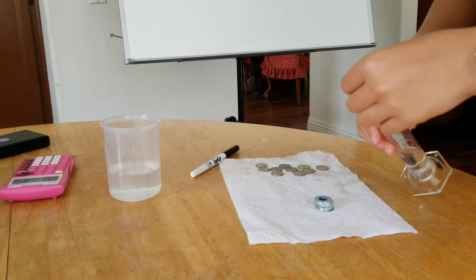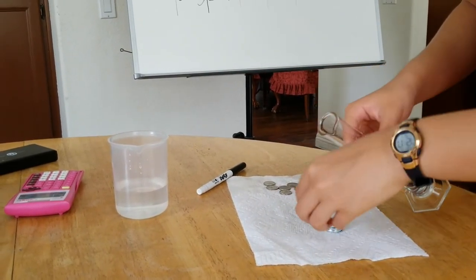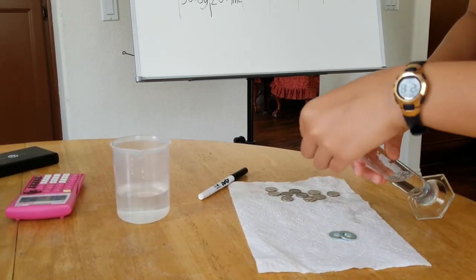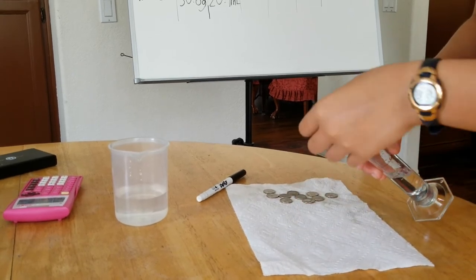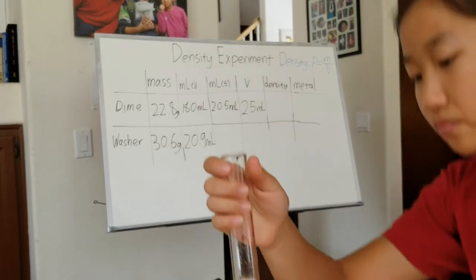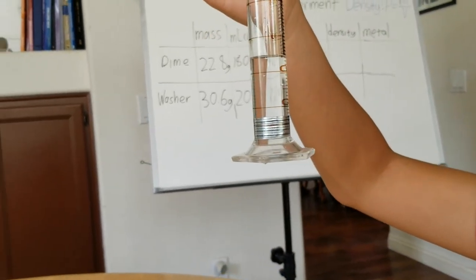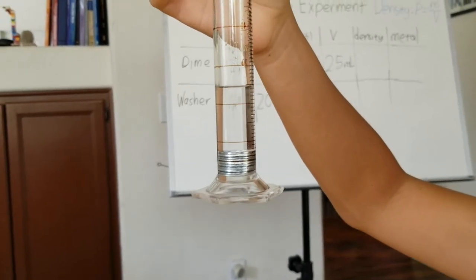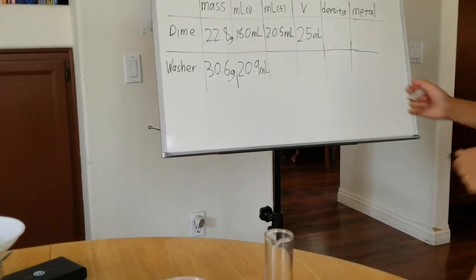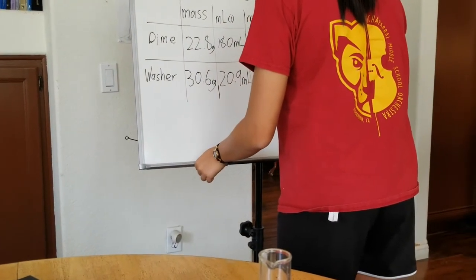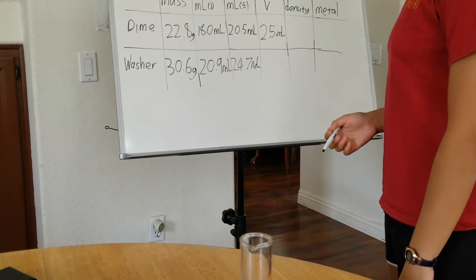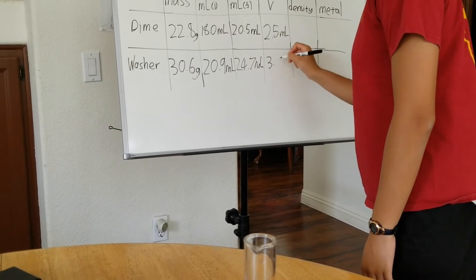And once again, just slide these in one by one so you don't make a big splash. Swirl it around, get the air bubbles out. And then now, lift it up again, bring it to eye level. That is at 24.7. So 24.7 milliliters. Now from here you can find the volume, 24.7 minus 20.9, which is 3.8.